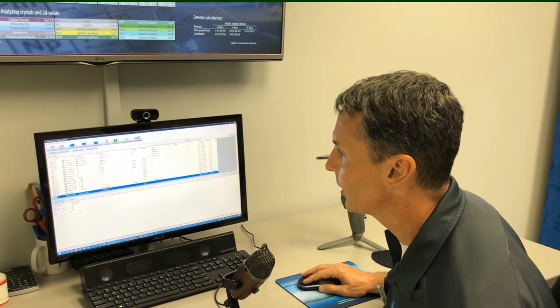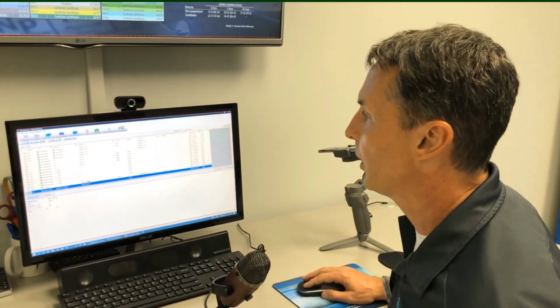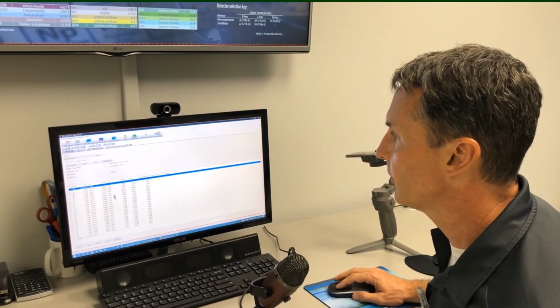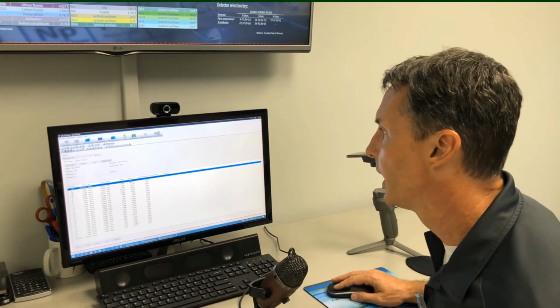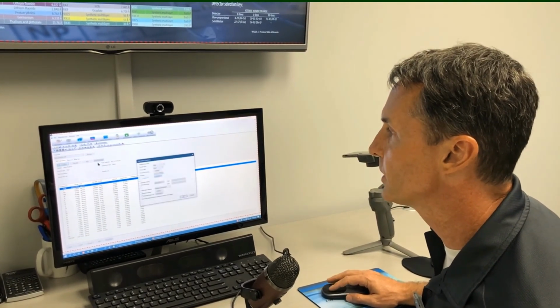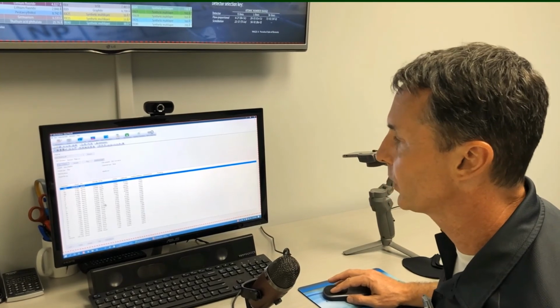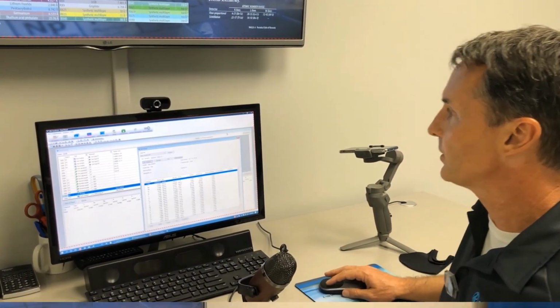So then if we look at our semi-quant, we had our multi-element standard, and essentially we see all the intensities here. If I right-click, we can see the full set of results. We'll see it as a coating weight, because that's what it is on the filter, and then it gives us the liquid concentration here. We can change different settings if we want to see that as a certain compound, and our results are here, both liquid concentration and coating weight. And it's really as easy as that.